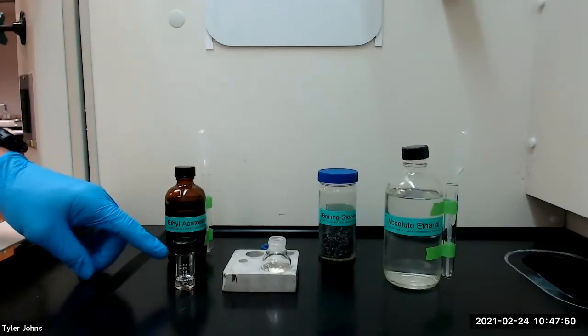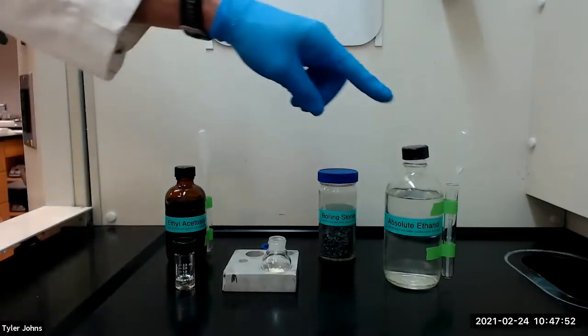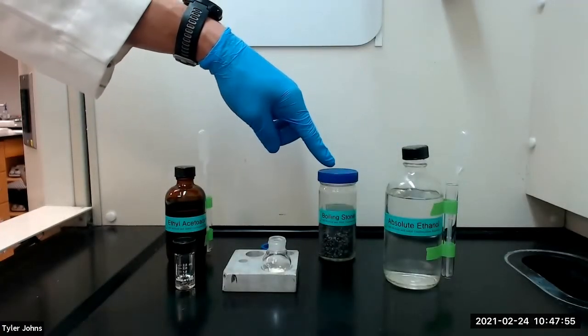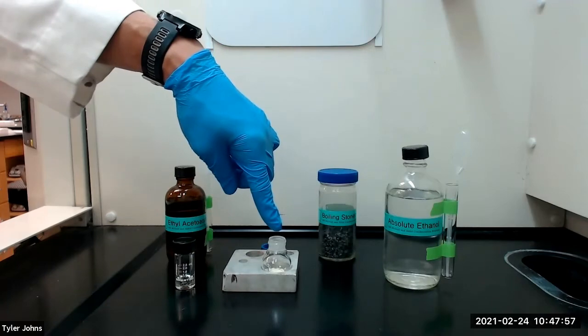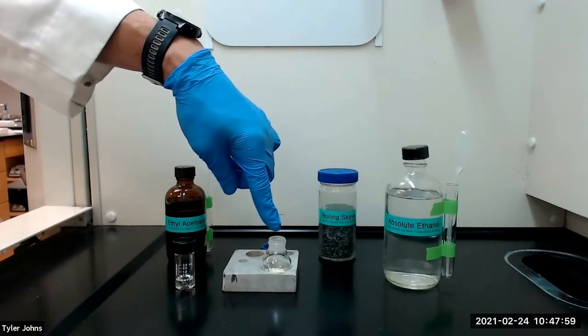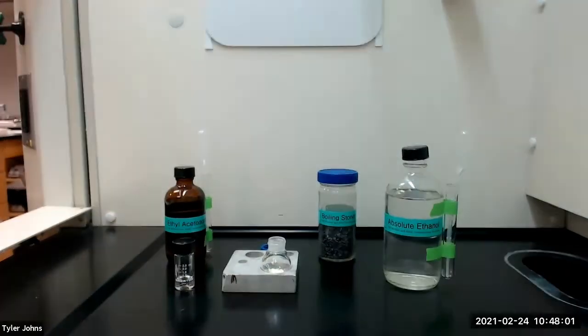We will next add the ethyl acetoacetate, 5 milliliters of absolute ethanol, and a boiling stone to the 10 milliliter round bottom flask. We will then swirl the flask until most of the solid has dissolved.